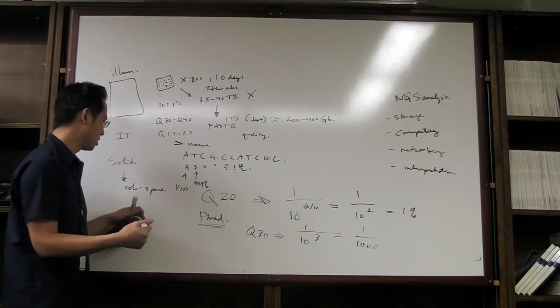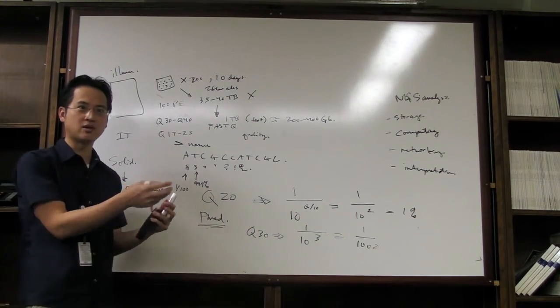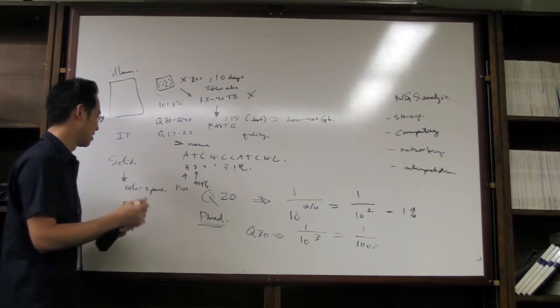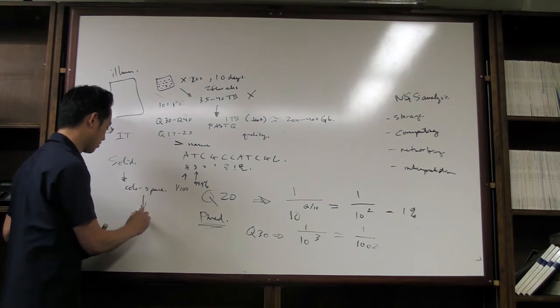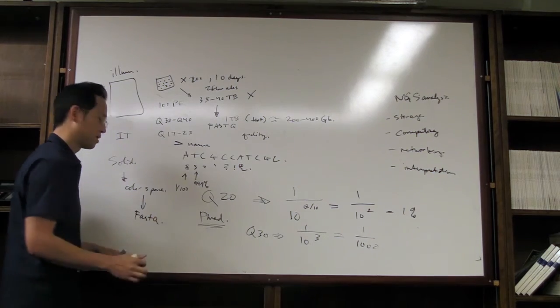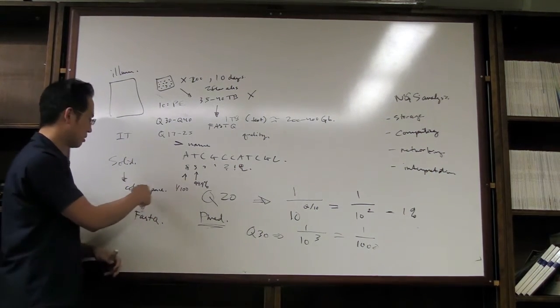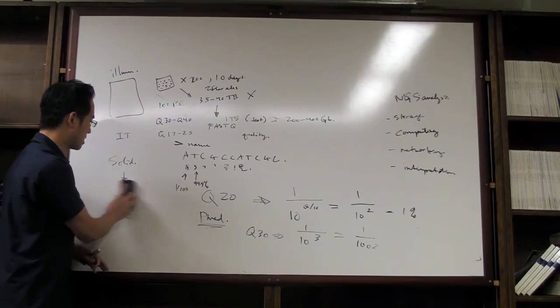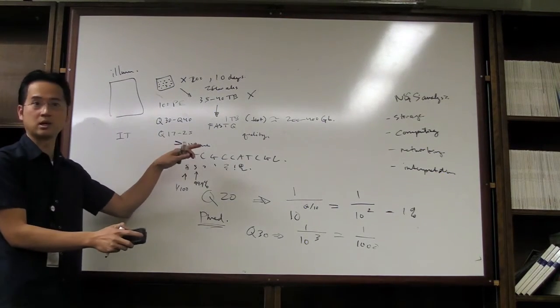And so there are options where you can map in color space, so you have a reference that's in color space, you have your sequence in color space, and then there's an option where you can convert this to FASTQ, and most people would rather work with that. So there are other formats out there that may or may not be well supported, but FASTQ is by far the industry standard.